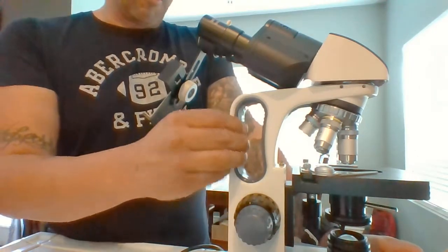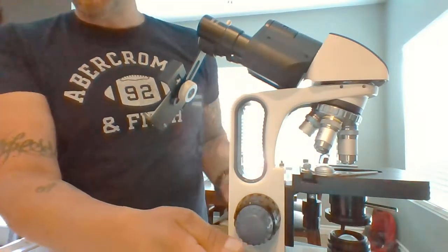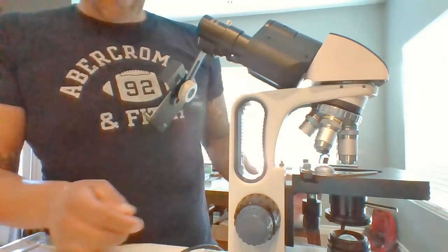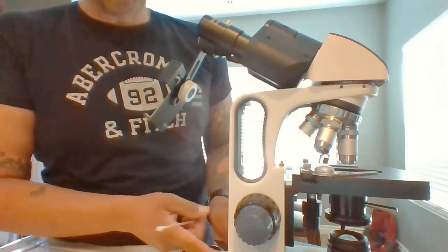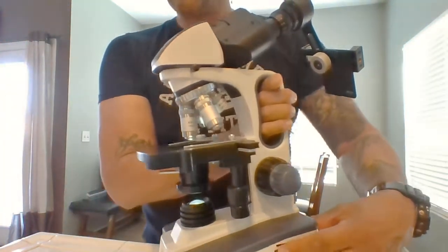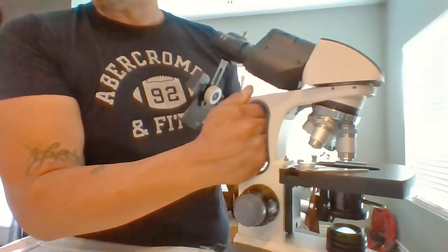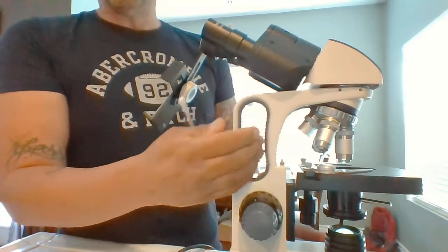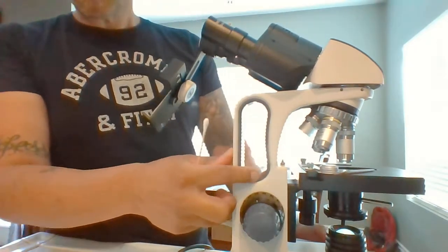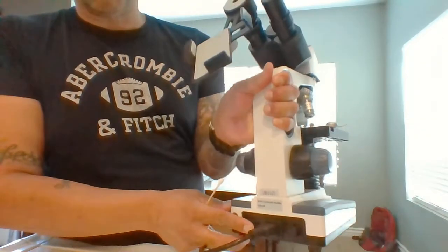Here we have the arm of the microscope. The base is down here. The light switch is here. I'm going to pick it up from here. This is the light part, and the light is needed to illuminate the slide from underneath so that it can be visualized when observing the slides. Here in the back, we have the on and off as well.